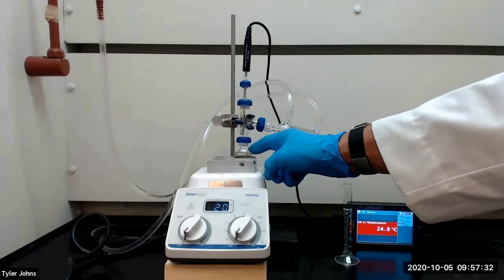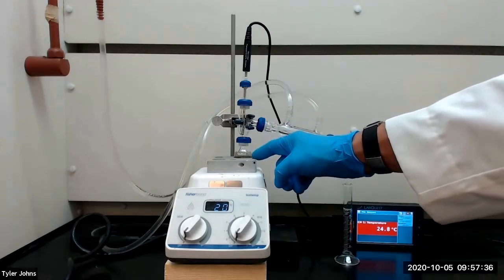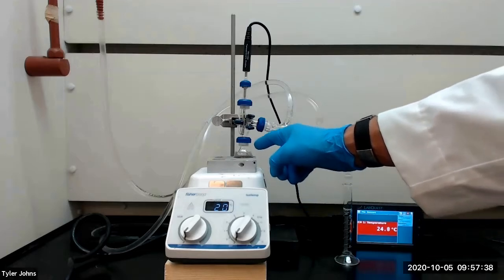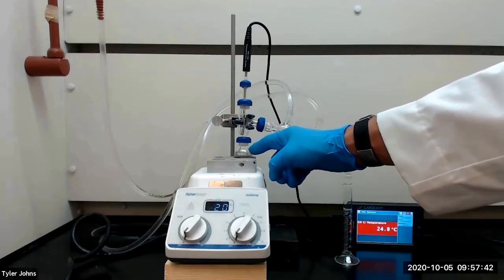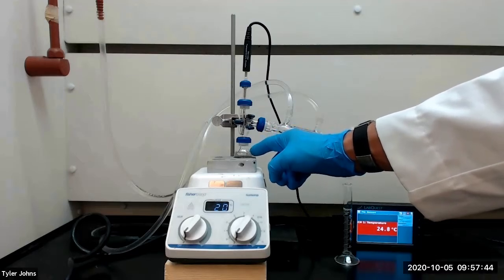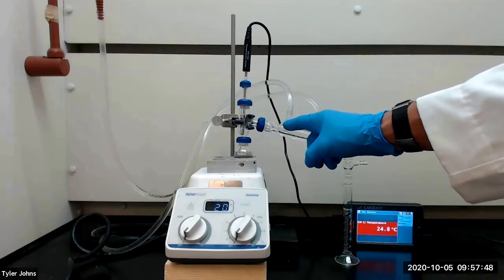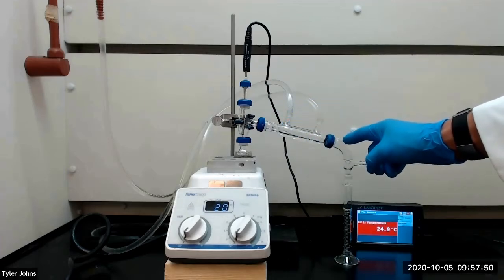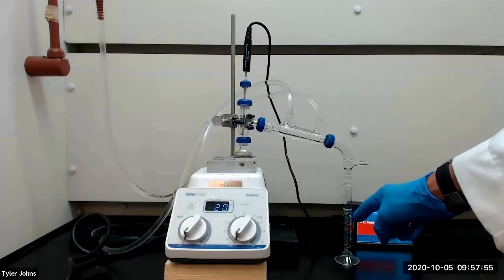We've now set our 10 milliliter round bottom flask with our 8 milliliters of unknown on an aluminum block on a hot plate, and we've connected our 10 milliliter round bottom flask to our simple distillation apparatus. Our flask is connected to a connecting adapter, which is in turn connected to a water-cooled condenser and a vacuum adapter, and we will condense our distillate into a 10 milliliter graduated cylinder.